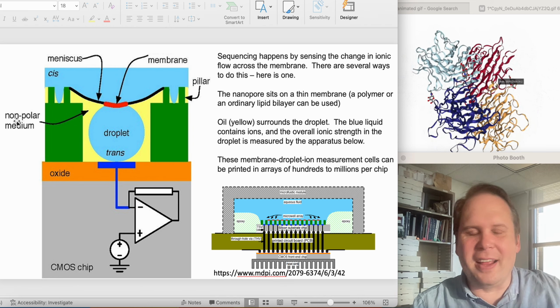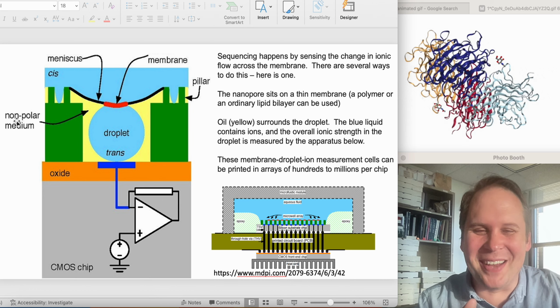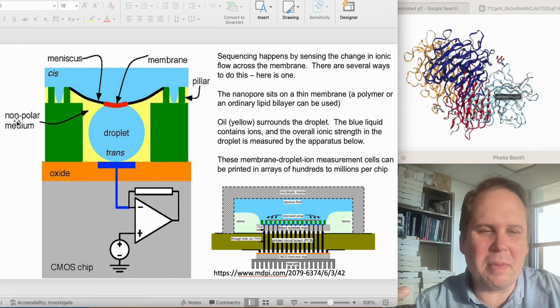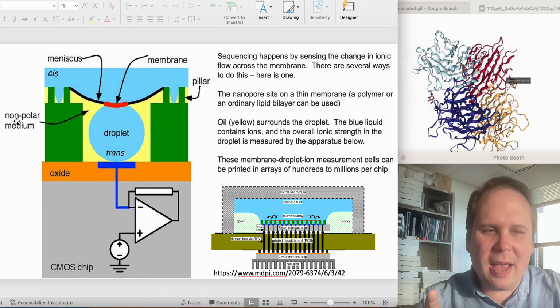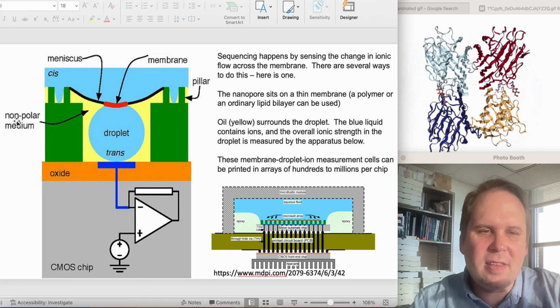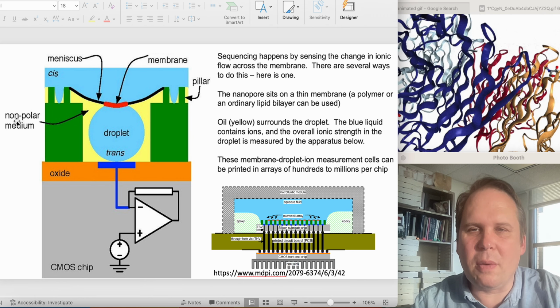And then, all right, so the ones who've had a physics class, this is for you. I don't really understand this. But this is basically the setup for how you can read whether or not there's a difference in membrane potential on either side of a membrane. There are other ways. It would be similar to what neurobiologists do to measure the transmission of a signal up a neuron. It's called a patch clamp technique is the one they always cite.